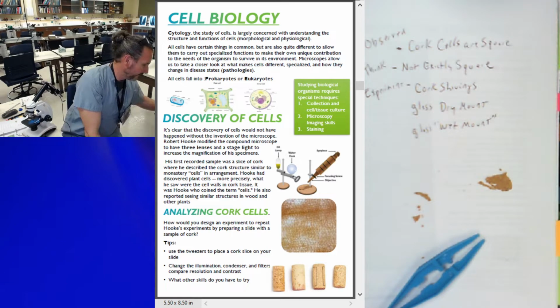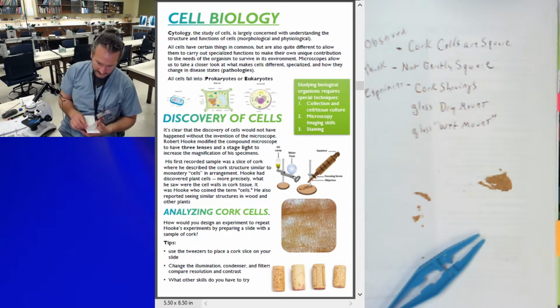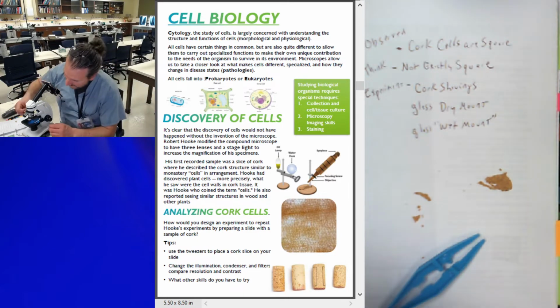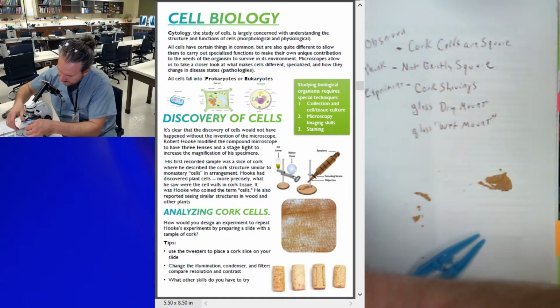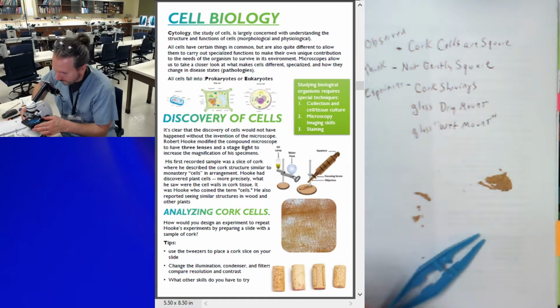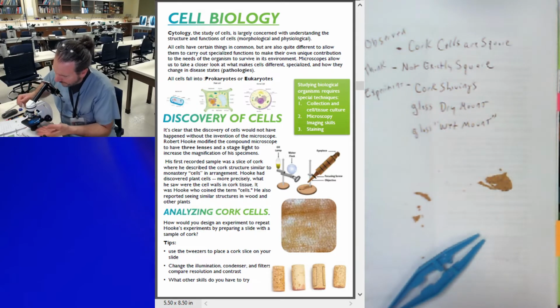So I'll take my tissue paper, lens cleaning paper, sorry. And this is good because this is the first experiment anyway, so we may as well clean that lens. I have something that's sitting on the lens. I'm not really sure what it is. It looks like a speck of dust, so I'm just running across. Yep, I think I'm okay.